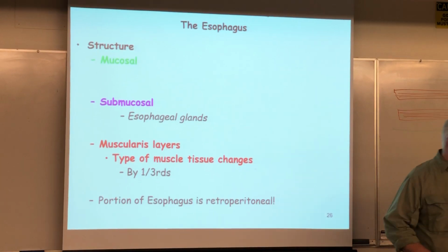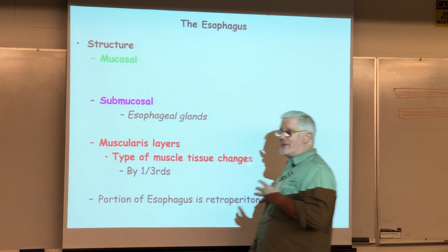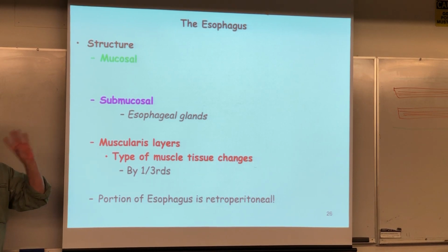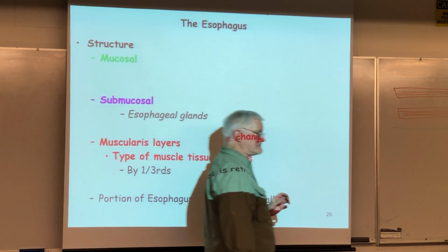Regions of the pharynx. We didn't get a chance to talk about our esophagus, so we will do that now. Keep in mind this is what we did last week. We looked at the various common layers of your digestive tract: the mucosa, the submucosa, muscularis externa, and the serosa, and the basic things we will find in those various structures. Then we started at the mouth and went through each region specifically, saying what they actually truly have in those 4 layers, what they share in common and how they're a bit different.